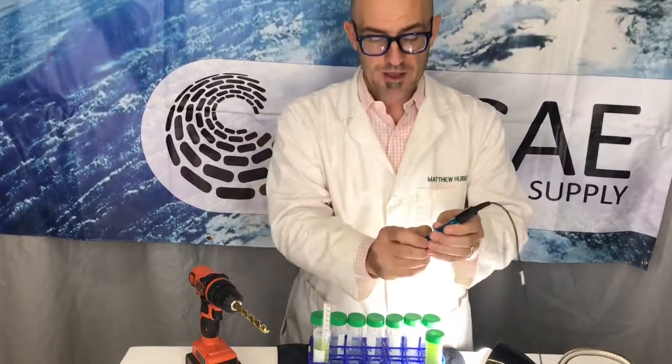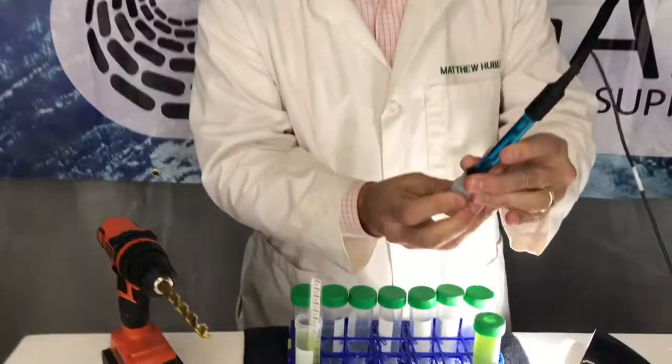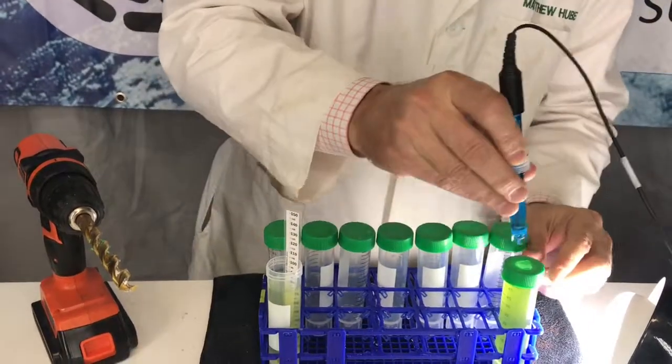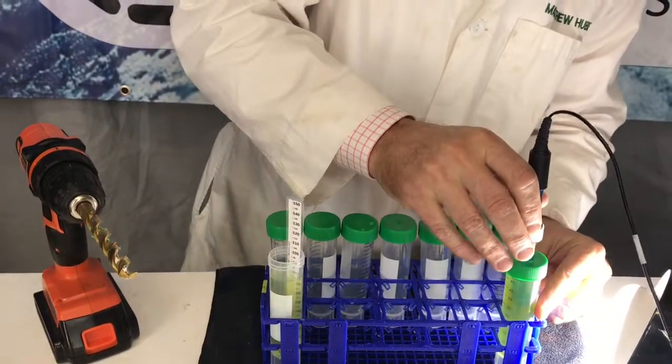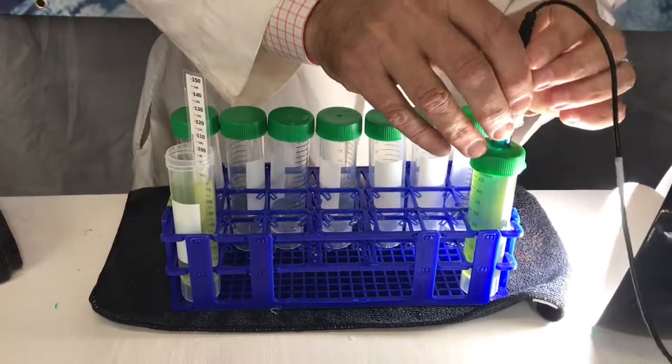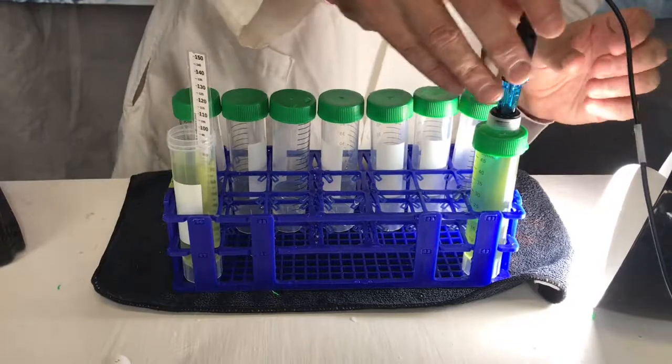Here's a pH probe. It's best if you have this connected to your computer so you can data log it. Then what you're going to want to do is stick the pH probe into the culture and make it so that the water squirts out — that way there's very little water space in there.